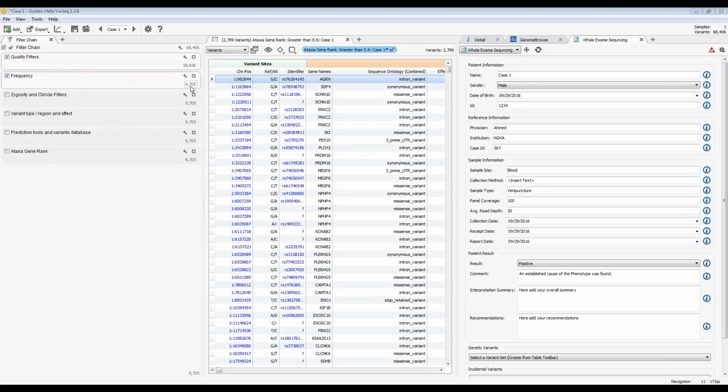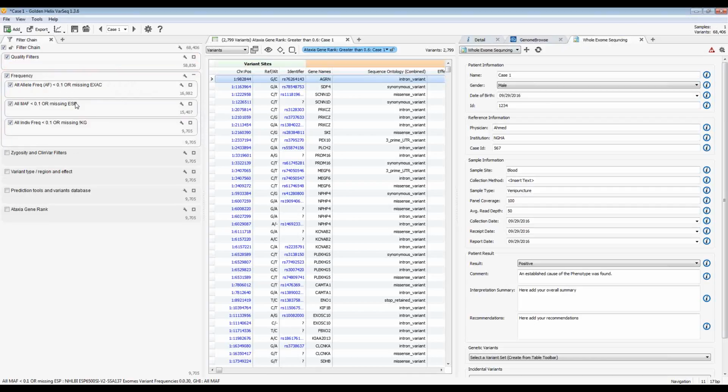However, someone would expect this number to be around 400, 500, 2,000, 3,000, or 6,000 at most. We think there are two reasons. One, these variants are not based on our database.